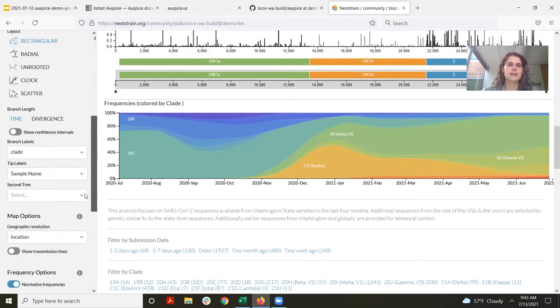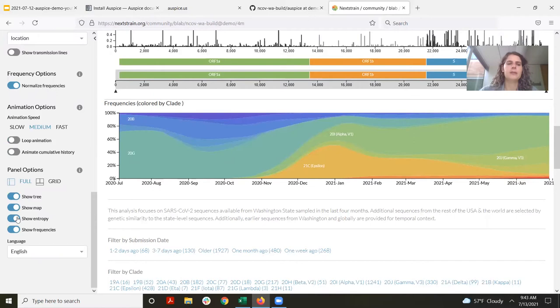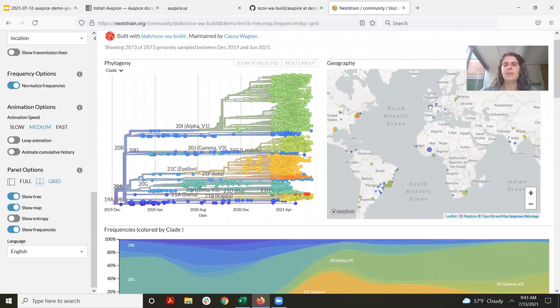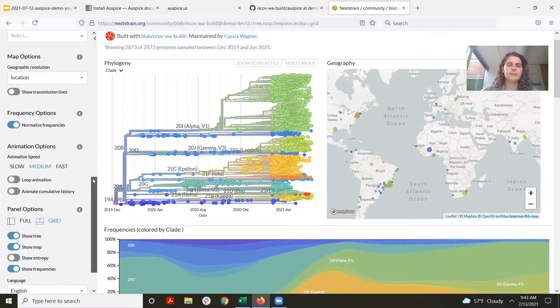We can control which panels are displayed using the toolbox on the side. I'm going to turn off the entropy panel because we won't be using that for the rest of the demo, and then I'm going to change the view to grid view. Now if we scroll back up, we can see that this has placed the tree and the map right next to each other, which will be easier for the rest of the demo.